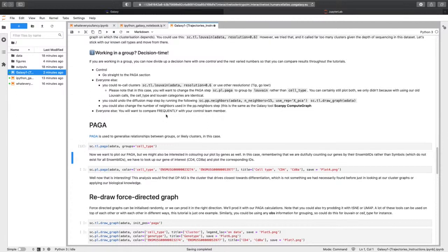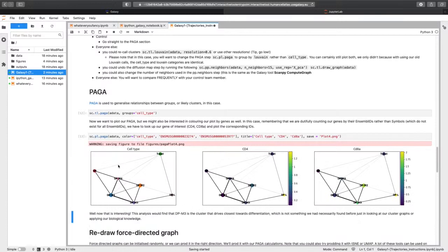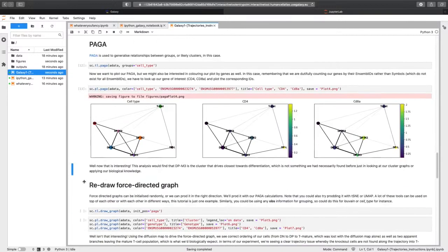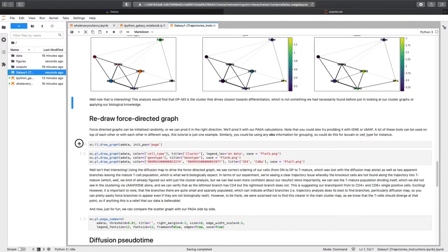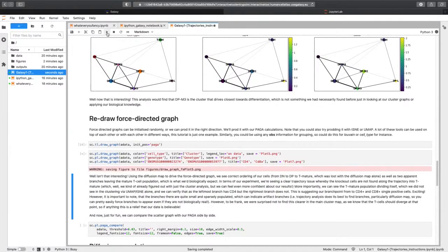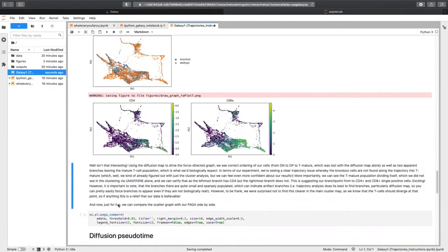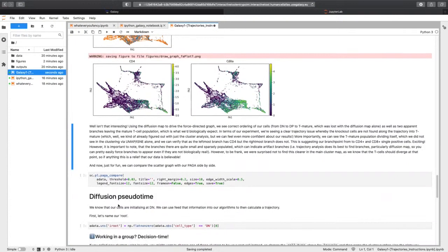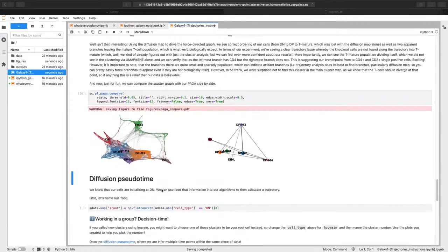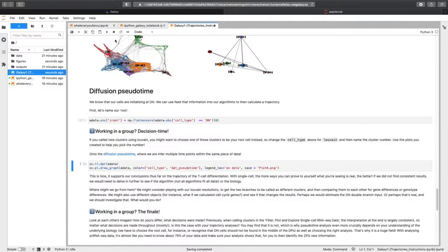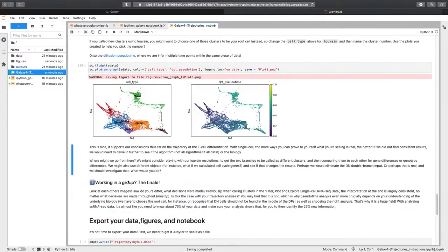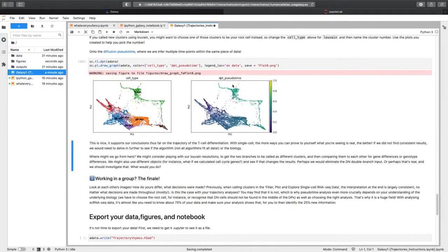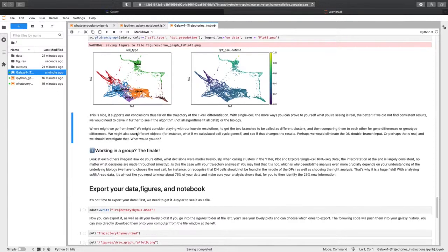Okay, you can, if you're working in a group, you can mix this up a little bit. We're on the home stretch of all the cool images. Plotting time. Cool. That's, that's just so cool. All right, and then we can compare. And we can do pseudotime. So we can see two branches.